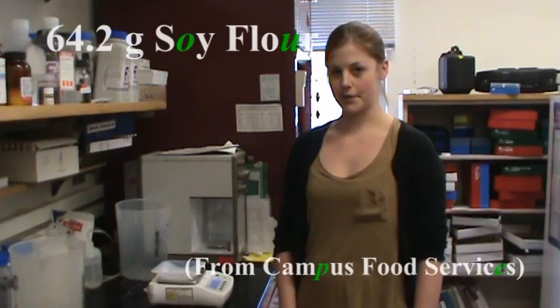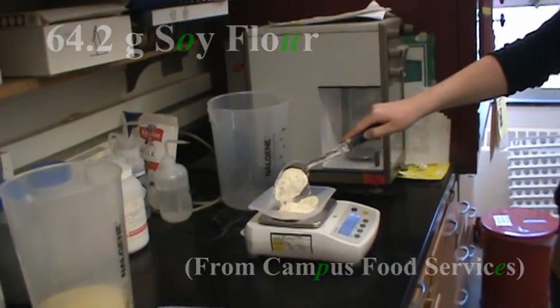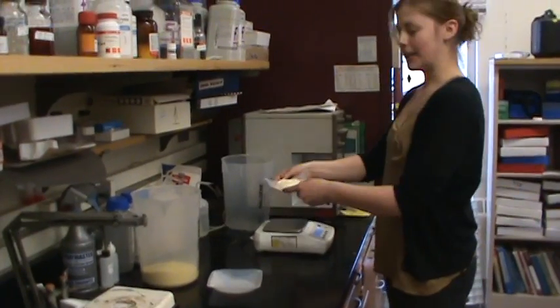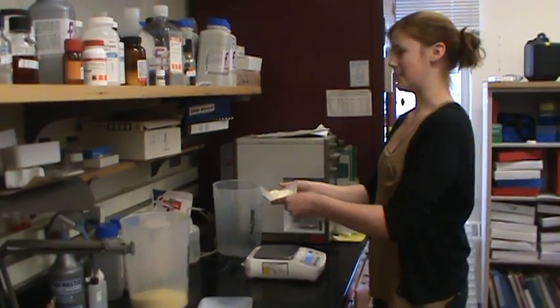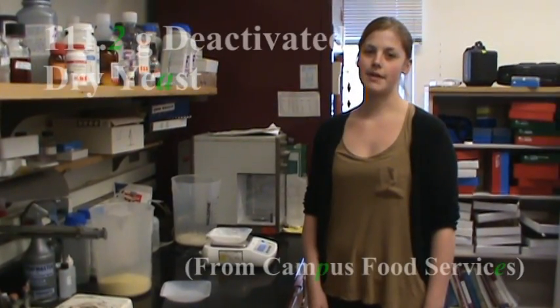Now into the second container we'll be adding 64.2 grams of soy flour. Be careful not to breathe this in. Now we're going to add 111.2 grams of yeast.